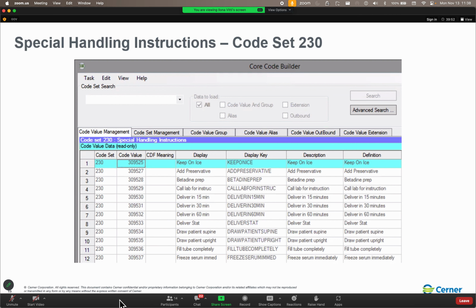So we have our default reporting priority. We already saw that this morning. And then we've got our default start date and time. Now we've already said T and N, that's today and now. But let's look at that AM draw collection priority here. So if an order is placed now with an AM draw collection priority, what is the default start time going to be? What's the default start date and time going to be for an order placed now with an AM draw priority?